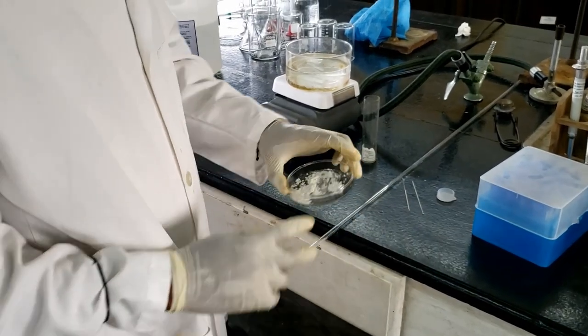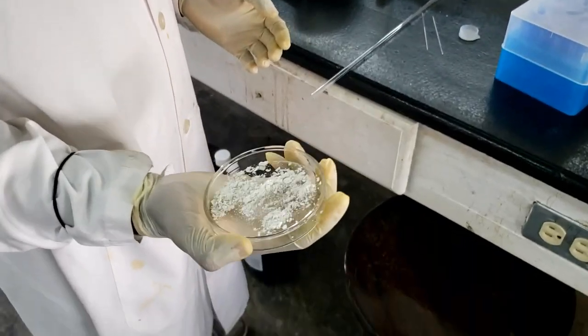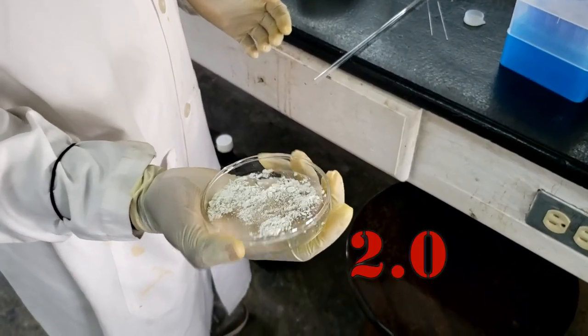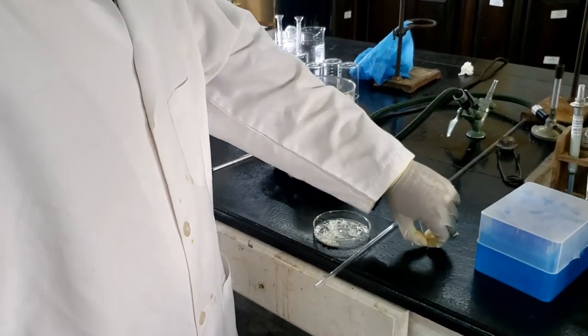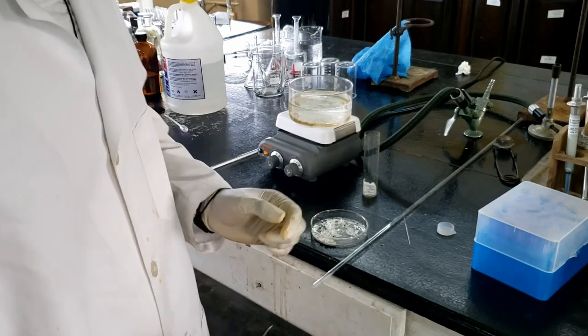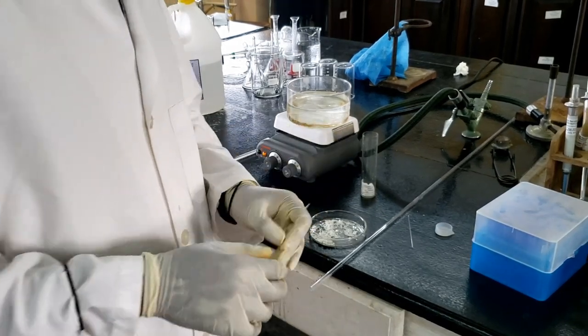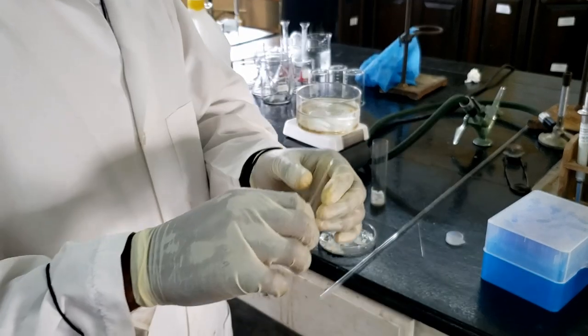Okay. So we've collected about 2.02 grams of the bromonitrobenzene crystals. So now for the melting point. Now we don't have any high-tech melting point apparatus. What I use are just capillary tubes. So I have some very small capillary tubes here.